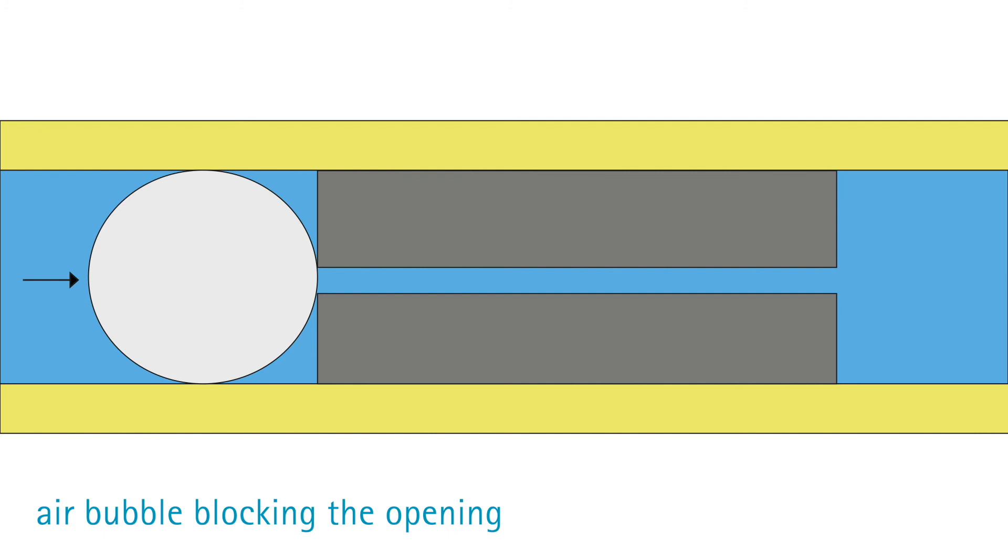A large bubble could easily block the restrictor opening, causing the system to leak if the amplitude is too high and you force them through under pressure. There are two solutions to prevent that issue.